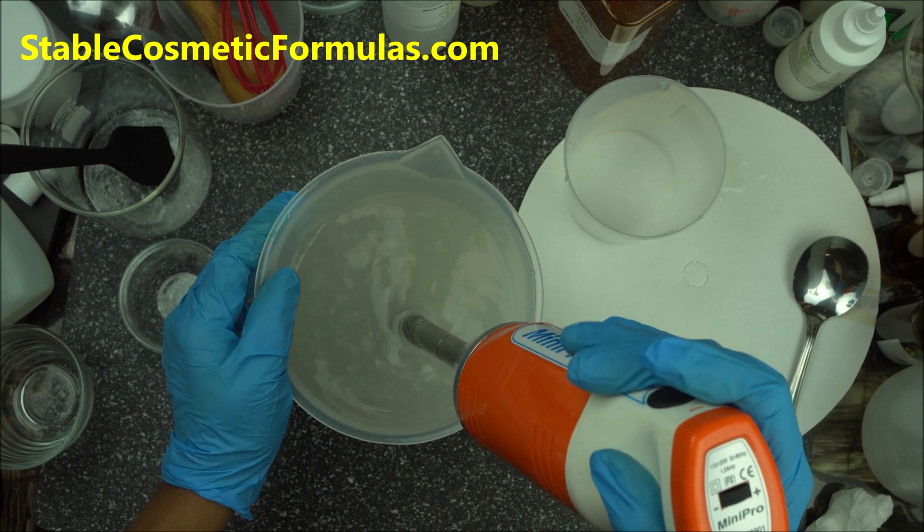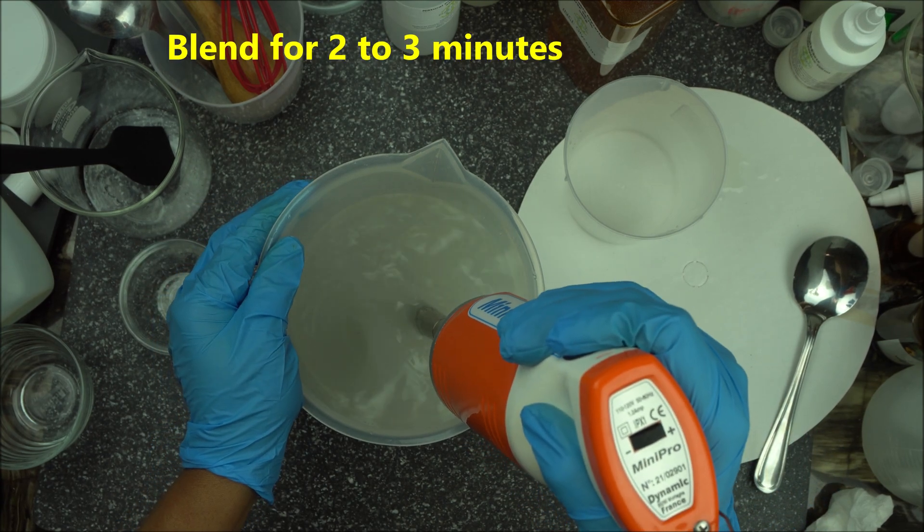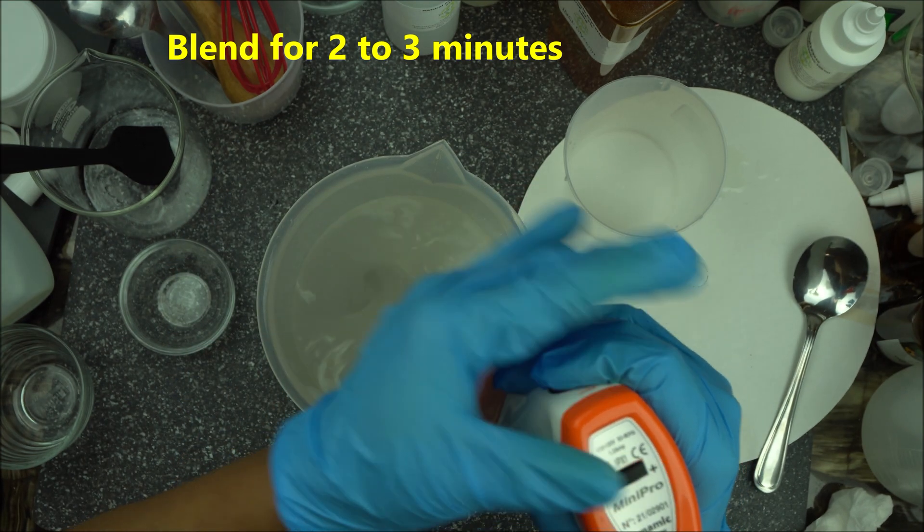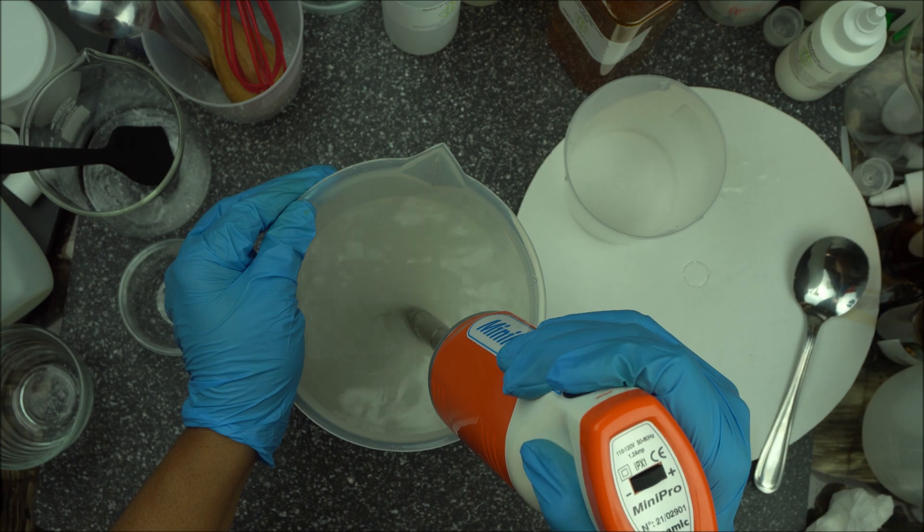Blend for two to three minutes. The stronger the vortex, the better your results.